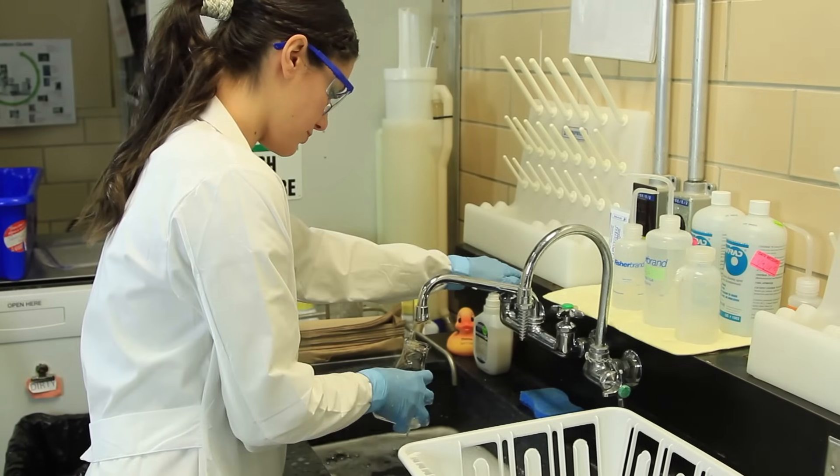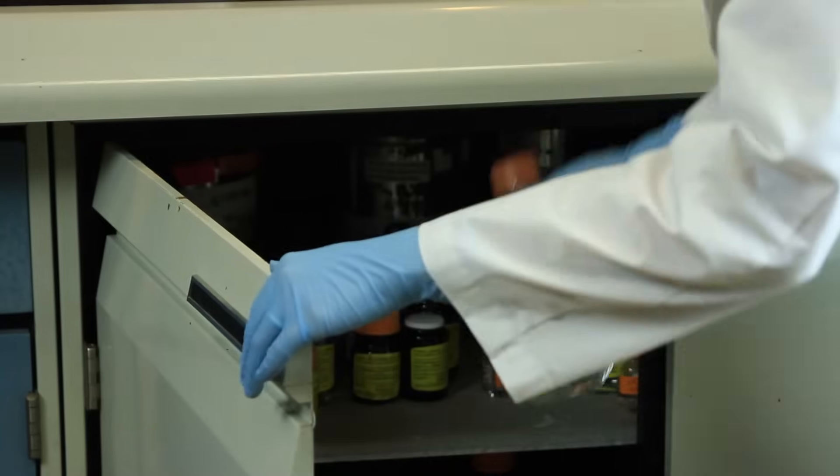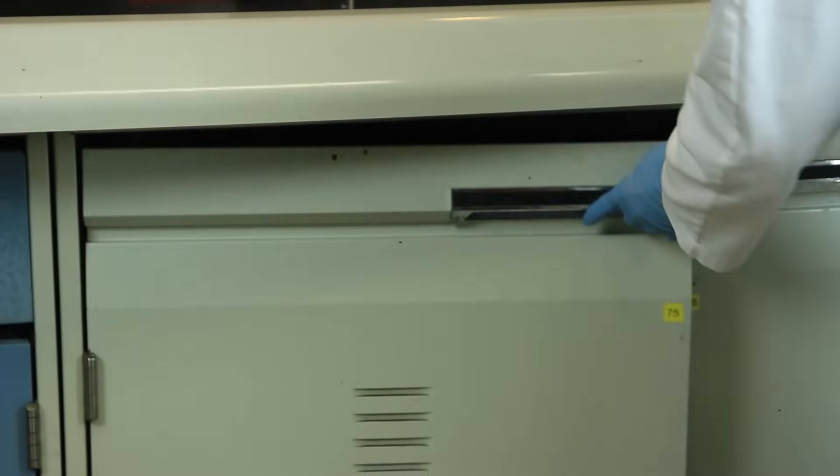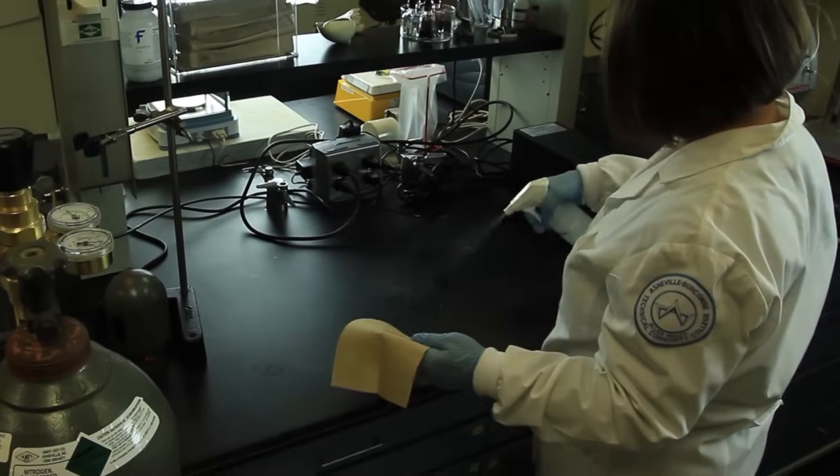After you've finished an experiment, wash and dry glassware, return reagents to the storage area, and clean the workbench surface with ethanol or isopropyl alcohol. If a safety violation occurs or you notice any unsafe condition in the lab, report it immediately to your supervisor.